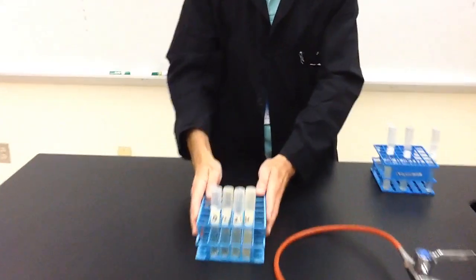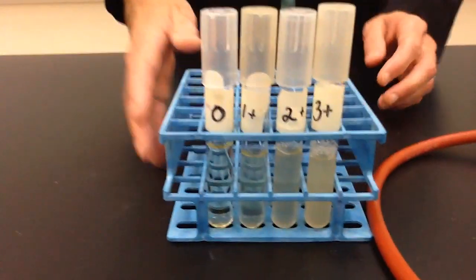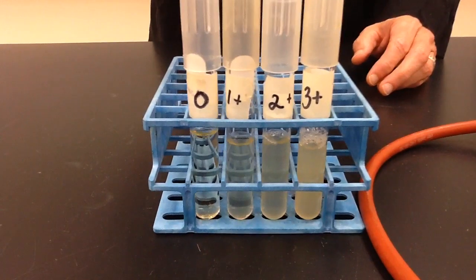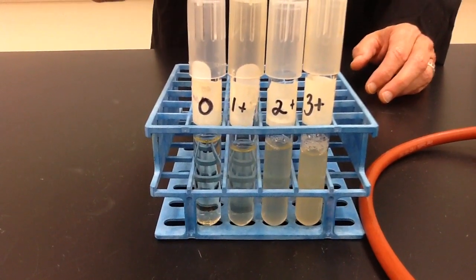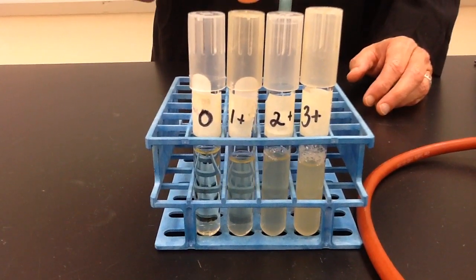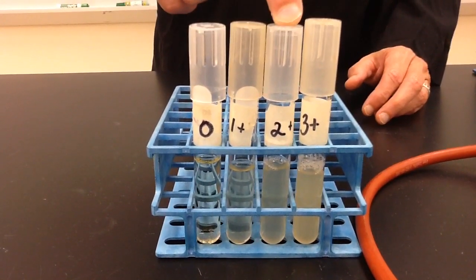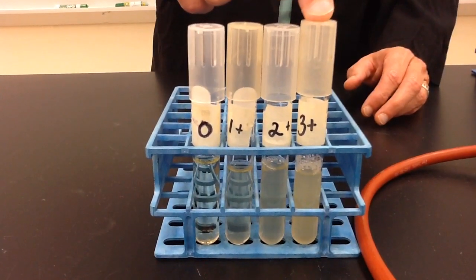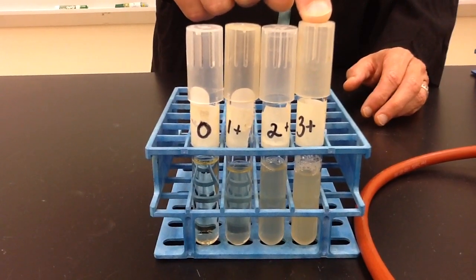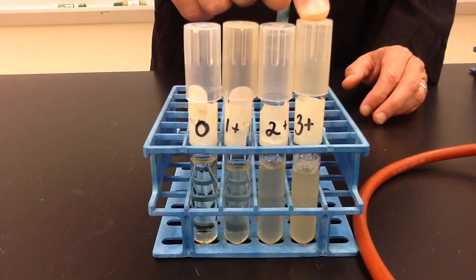But just to remind you of how the growth is going to be scored, if you have perfectly clear, you're going to call that a zero when you do your temperature. One, a little bit cloudy. Two, more cloudy. And then finally, a 3 plus is going to be where you can't read anything through that tube.